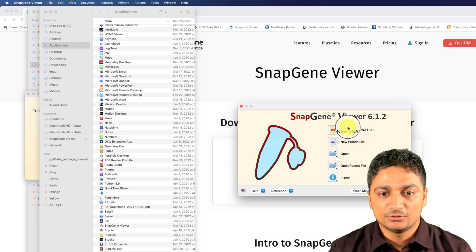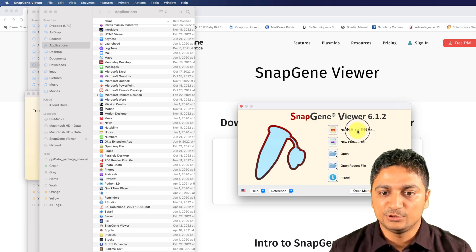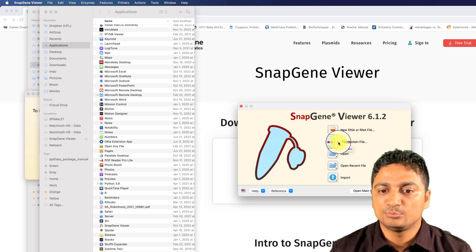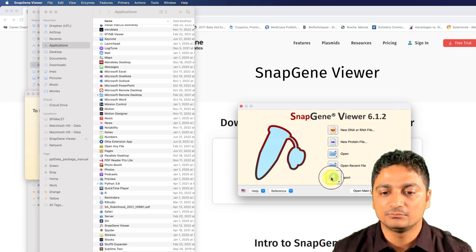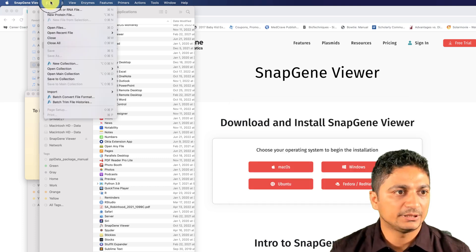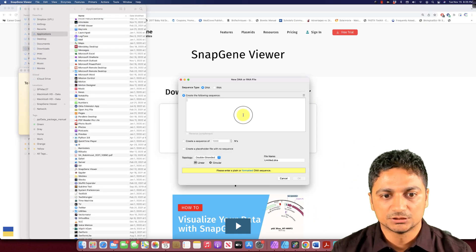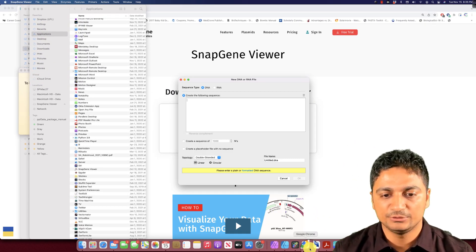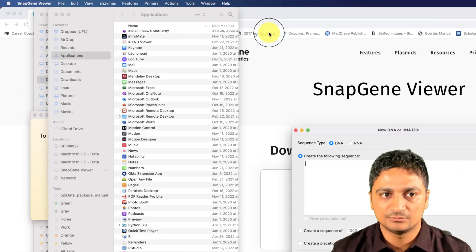After opening SnapGene Viewer, you can make a new DNA file, make a new protein file, open an existing file, or import from any other software. Let's close this and make a new DNA file. If you want to make a new DNA file, we'll need some sequence.